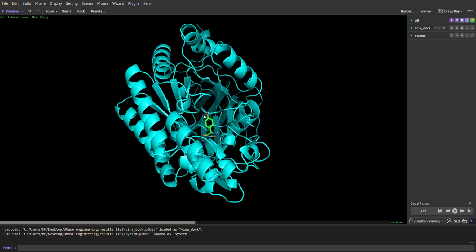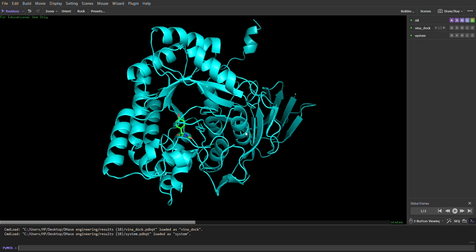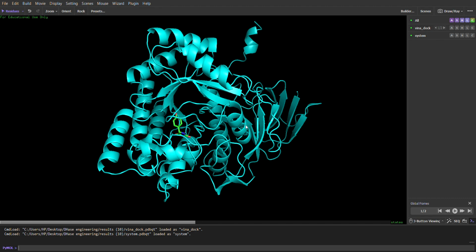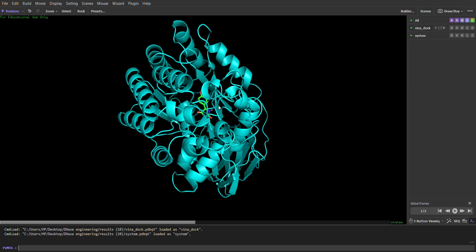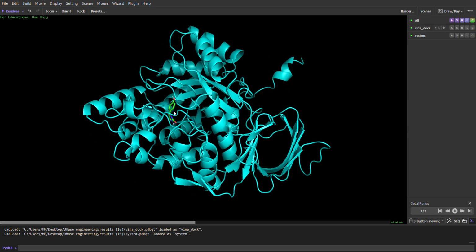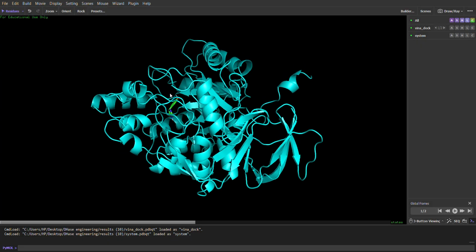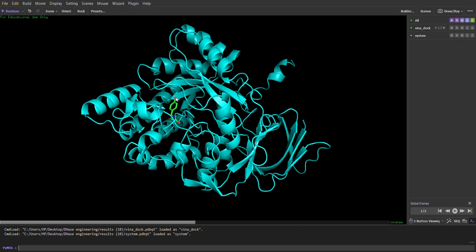This can be confusing to someone who is not well conversant with the structures of proteins, but let me start with a simpler one. The other thing that I can see is that this can be the base of the enzyme, and from this side can be the access point of the substrate.